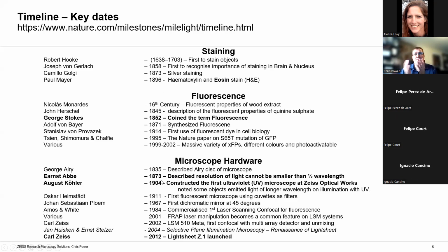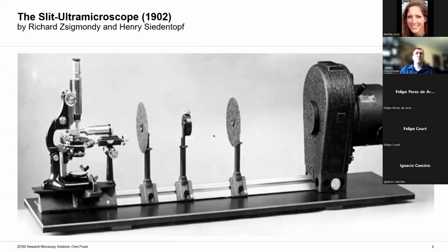And if I describe how we got from fluorescence microscopy to light sheet, I'm going to show that over the next few slides. So when people talk about microscopes, here you see a classic microscope on the left. Really, microscopes do three things. And the first everyone knows is make small things look big, but you also care about resolution and you care about contrast.